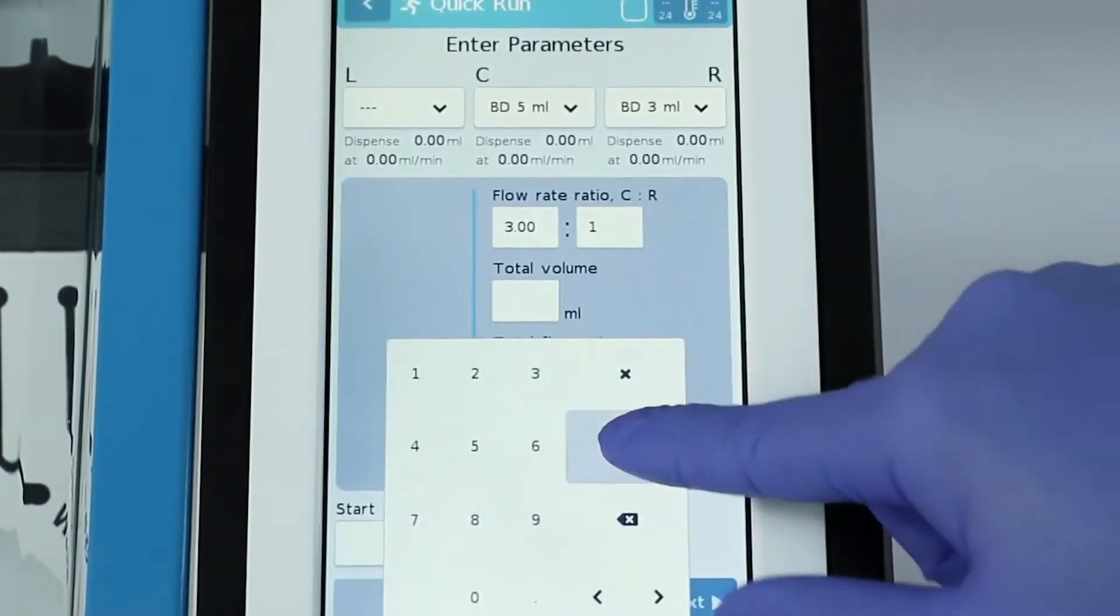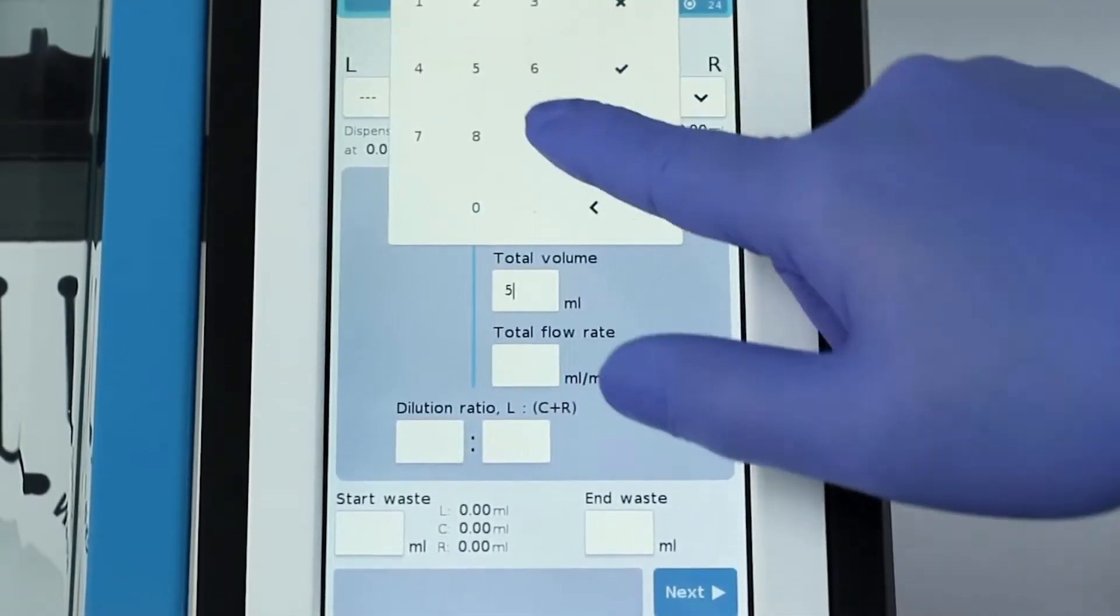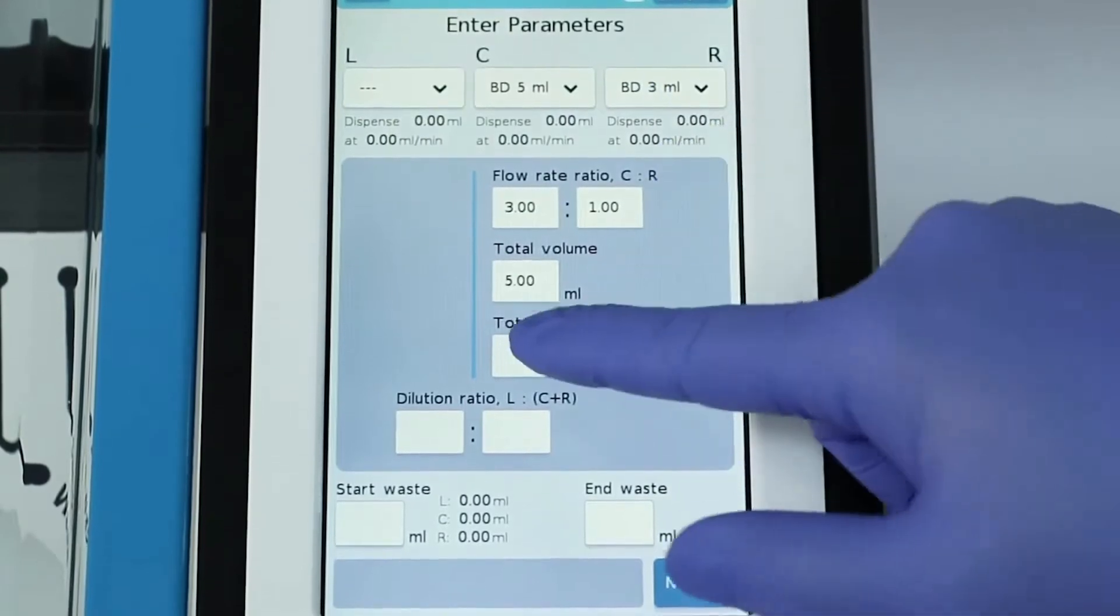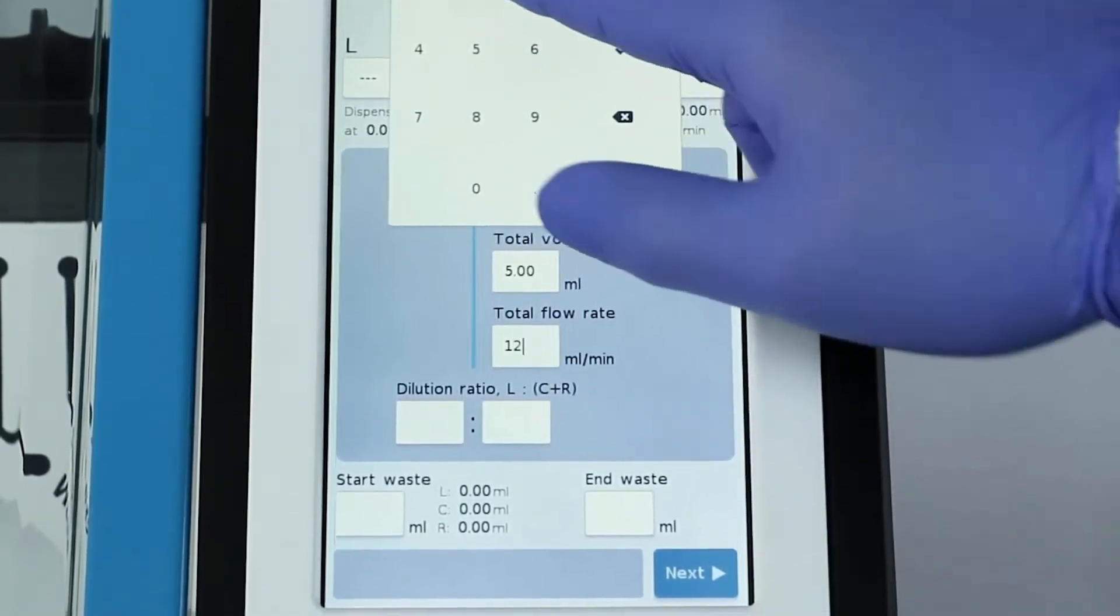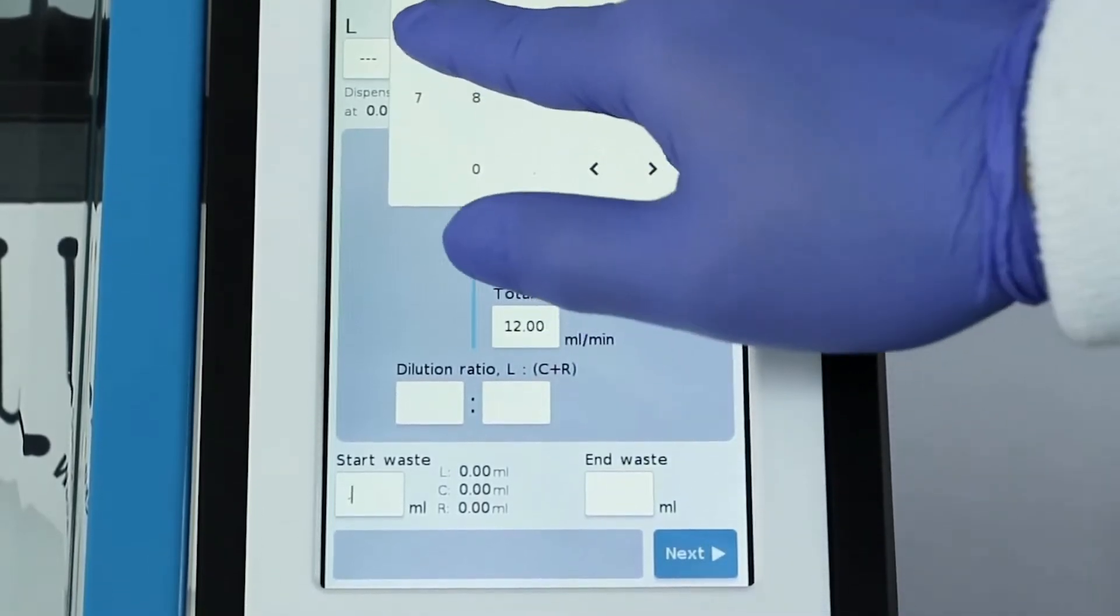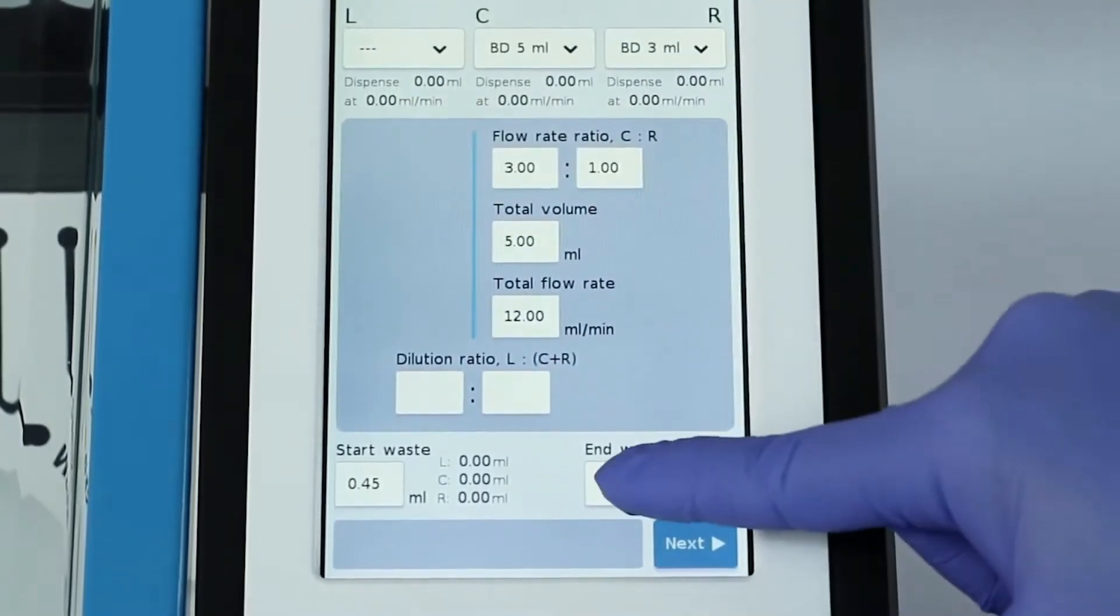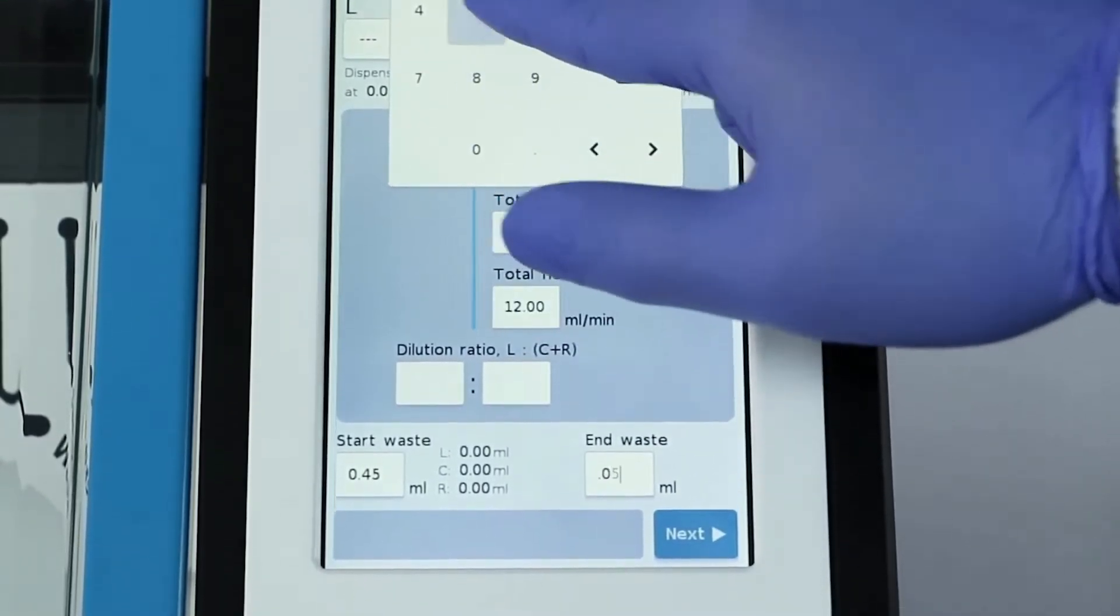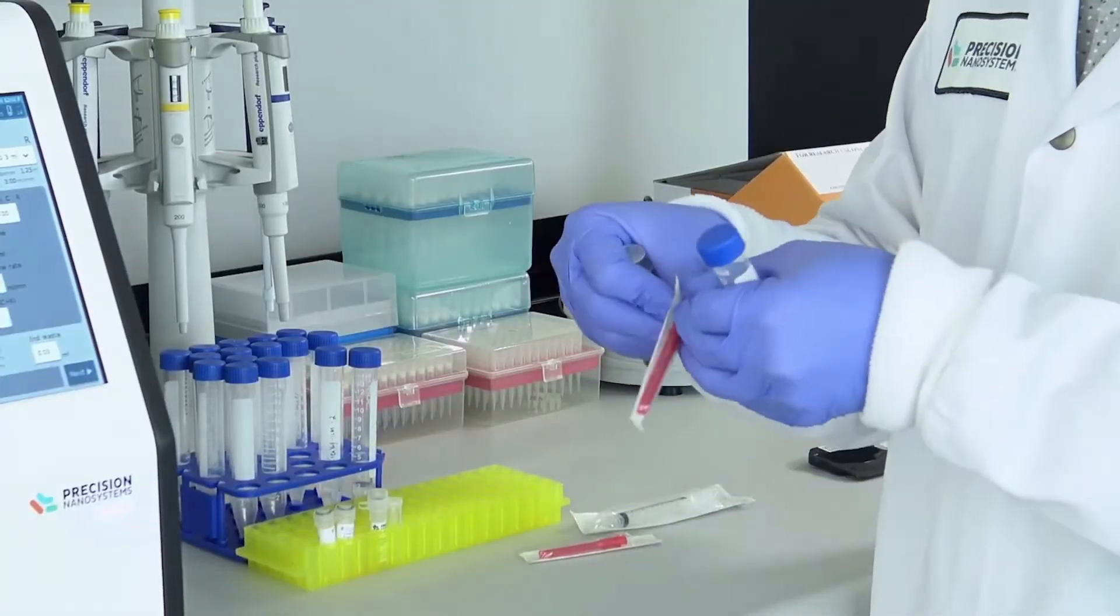We took our NxGen technology, which was designed for GMP production, scaled it down, and designed a system around it to enable scientists of any scale level to explore the nanomedicine design space. The Ignite's interface puts key parameters that define the conditions of particle formation, such as total flow rate and flow rate ratio, literally at your fingertips.